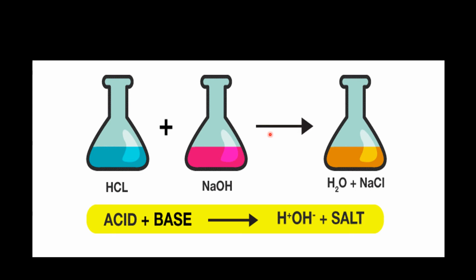This is the tabular form of all the data which I have taken from the burette. Basically, I have taken hydrochloric acid solution in the burette. I filled up the burette up to 0, and when I used it in titrating sodium hydroxide solution, the reading comes to 10. So basically 0 is the initial reading and 10 is the final reading. So there is a difference of 10 cm3.